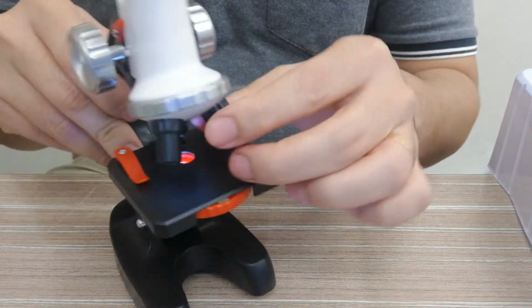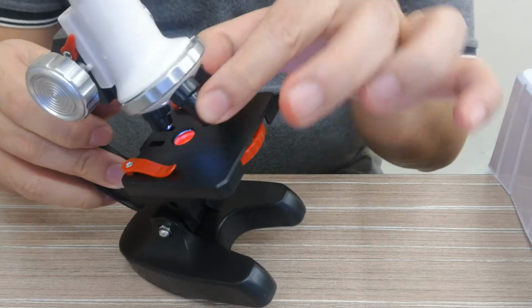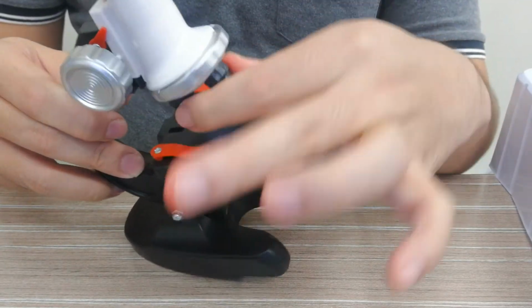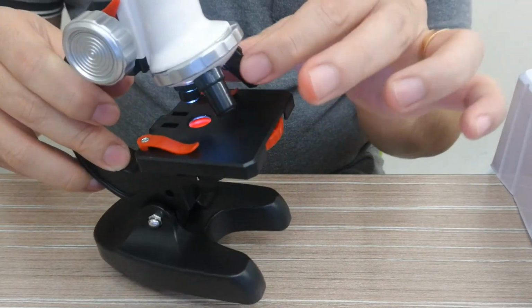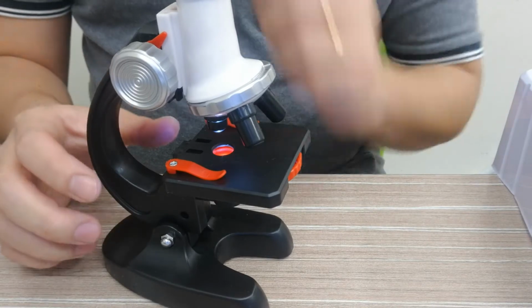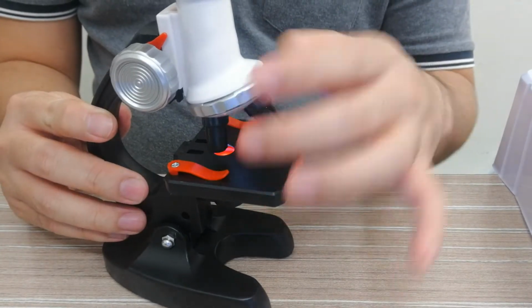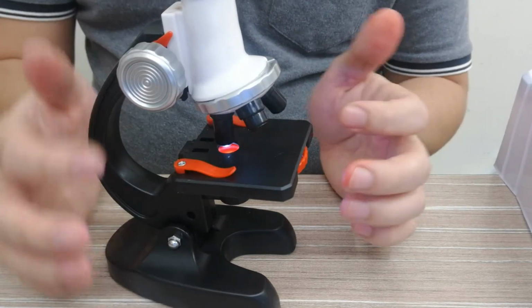You have three kinds of zoom over here. You can see there is a shortest to the longest. The longest one has the highest power, and the shortest will have the weaker power. If you want more zoom in, more focus, then you take the longer lens.